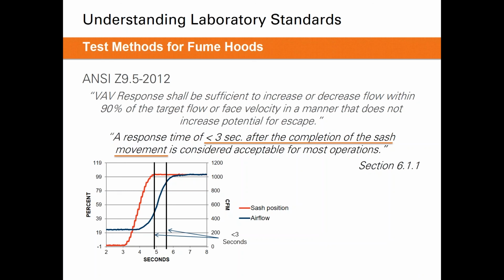So the big thing here is just how they define that speed of response. Here we can see that it's defined as the completion of the sash movement rather than the start of the sash movement. So in most cases, less than 3 seconds will be acceptable, according to ANSI.